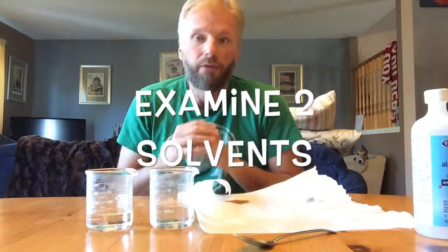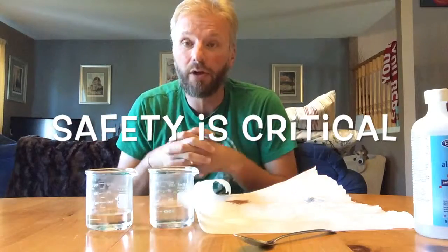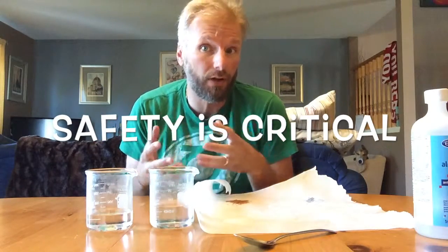So we're going to look at whether all solvents are alike. We're examining two solvents, and very important with this one: you never ingest anything, you never sniff anything, and you're very careful with this. So what we'll be doing again is mixing stuff and seeing if all solvents are alike, because it's important to know if all solutes will dissolve in solvents. That allows us, when we're making things, be it industrial, be it through food, be it through a number of items, to know how items react.